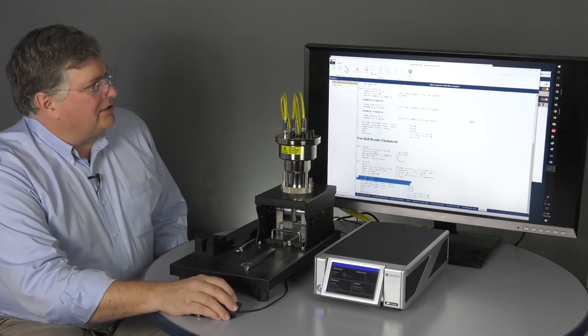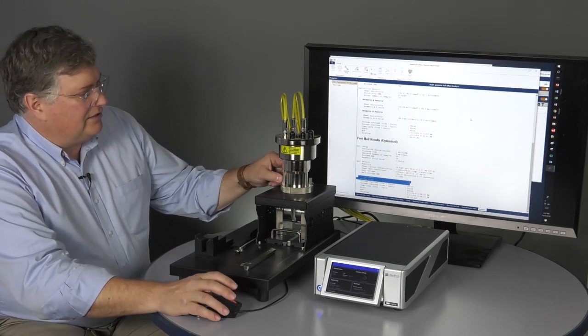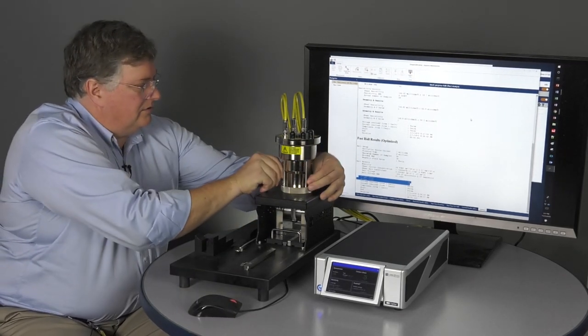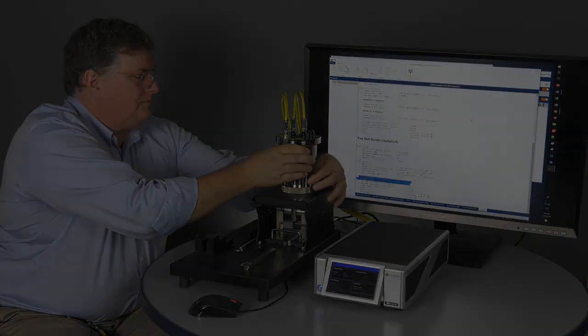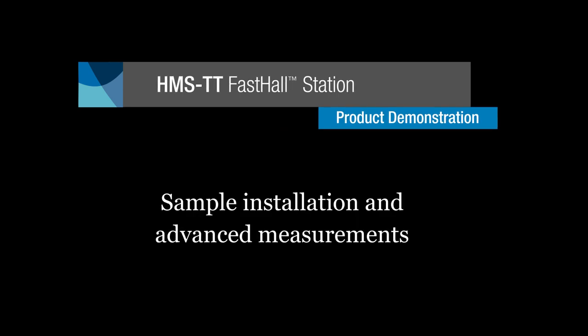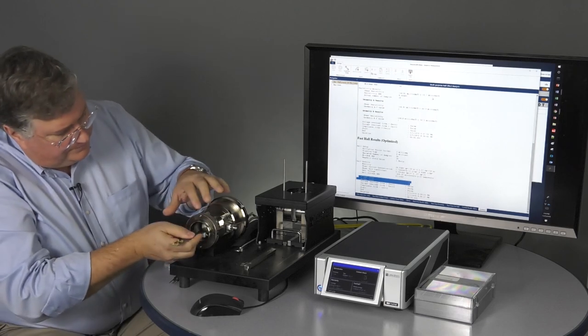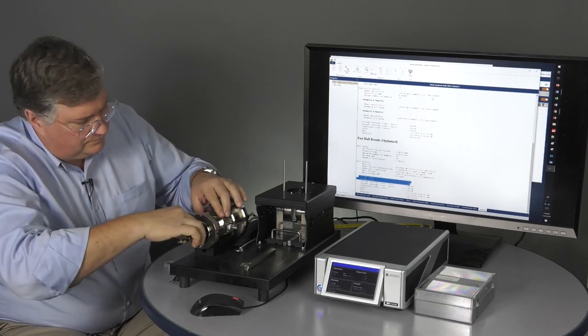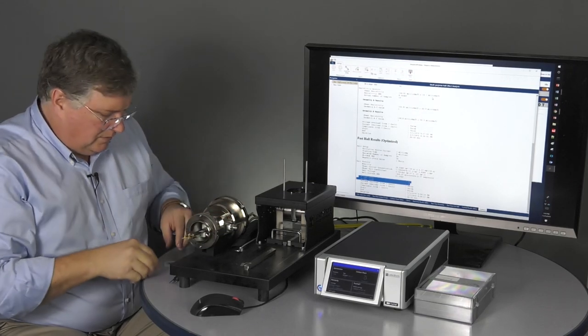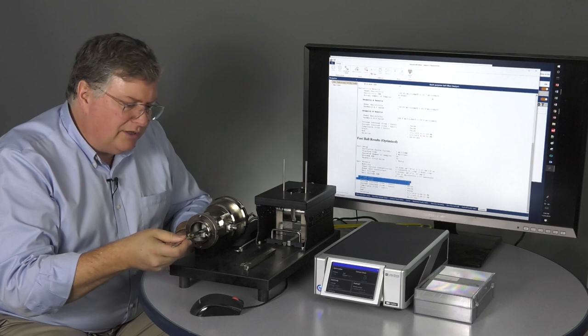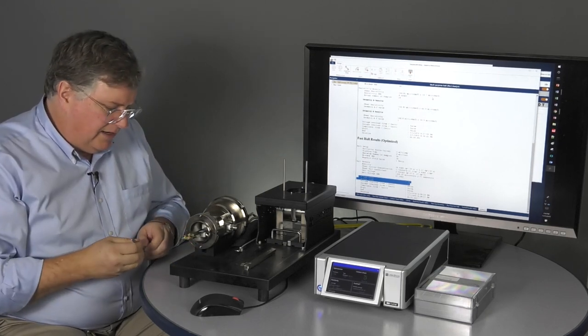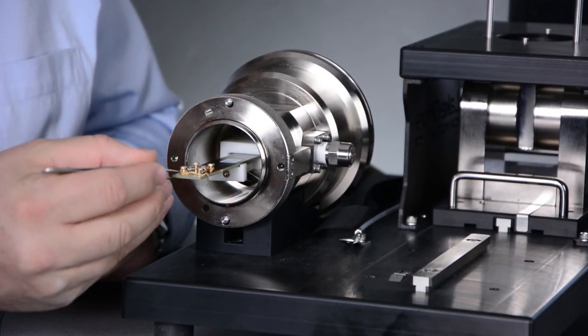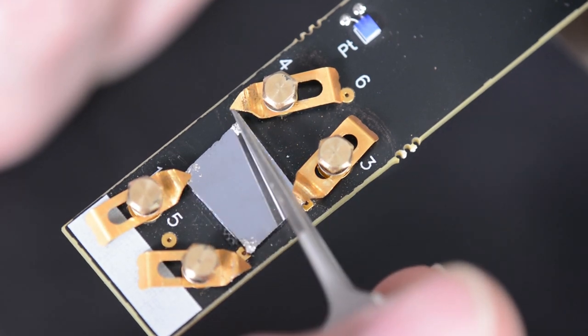So that really is the indium arsenide demo. What I'd like to do now is show you our sample card and a little bit more difficult sample. Go ahead and put this probing card in. And then what we have here is a number of spring-loaded contacts. And I have a, so this is an indium arsenide sample.